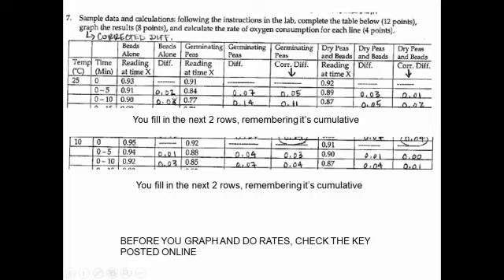However, we know that 0.02 of that is not due to metabolism. It's just due to pressure and temperature changes. And so we have to subtract that out and say that really the amount of change due to metabolism is only 0.05. Okay, so this number is the corrected difference. We get that from taking this number and subtracting the beads amount.